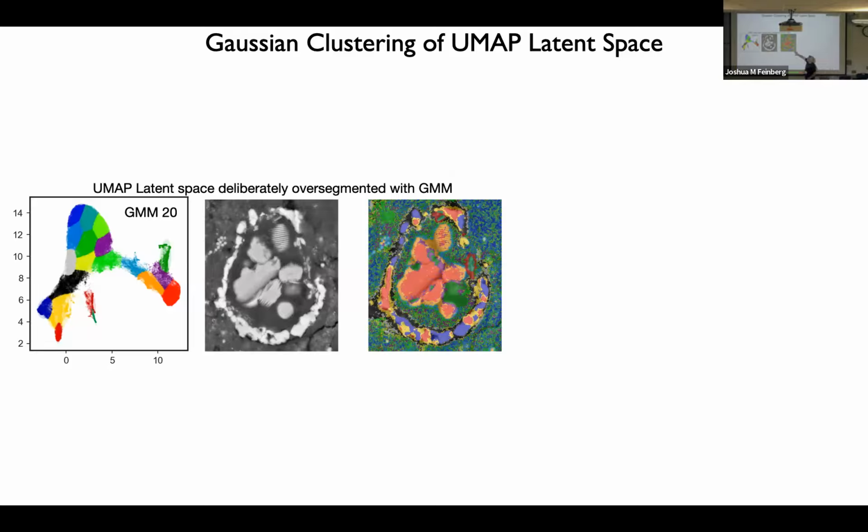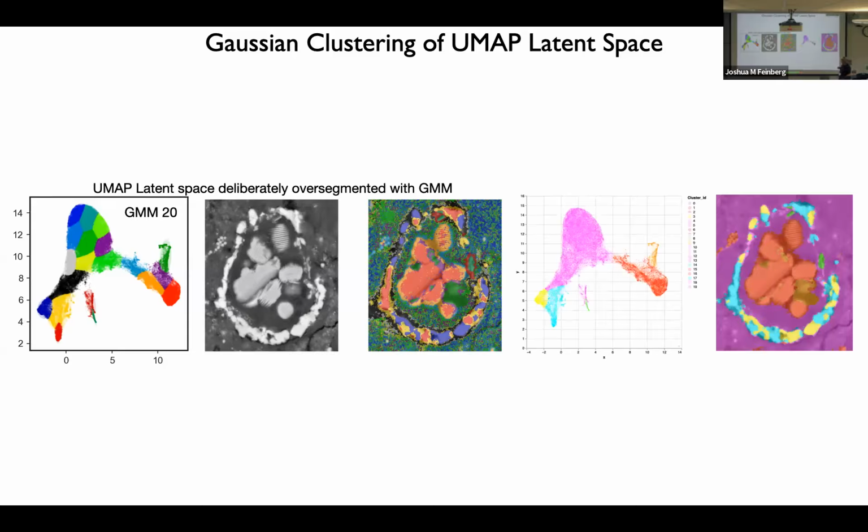You can see these colors are picking out this sulfide rim. The red and orange and purple are picking up the magnetite. This green thing sticking out here is something distinct. And then you've got the matrix phase here, which you can see has chemical heterogeneity in it. There are regions that look more blue and regions that look more green, and that's because there's chemical variation within the matrix. So using our software, you can interactively select these clusters and merge them or color them in order to make this simpler and more useful. And then you can start to label these things.